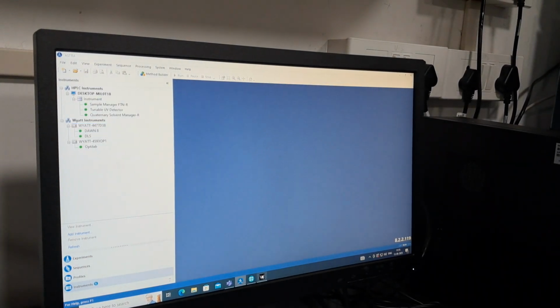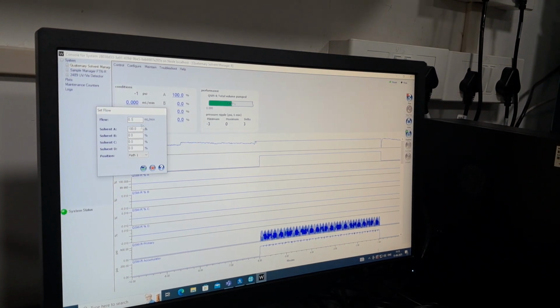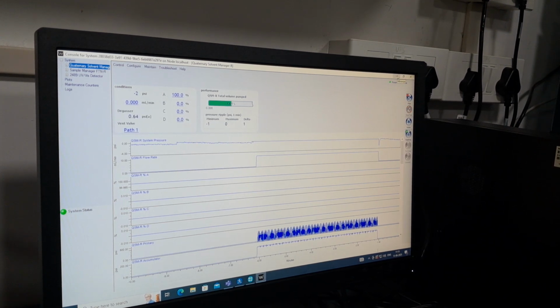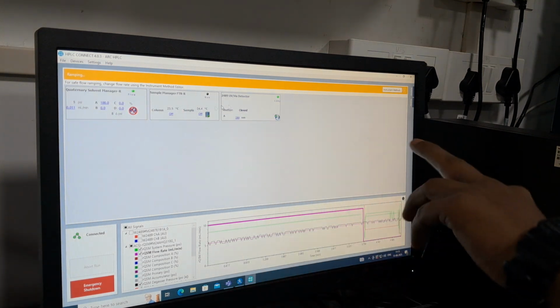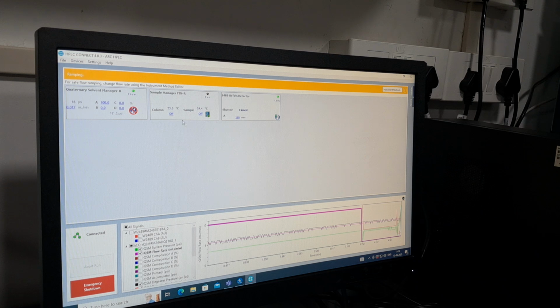Now the flow rate we are able to set here. Ideally we are using 0.5 flow rate. Now I'll be increasing it step by step. This console, if you want, you can familiarize yourself with it. If it is easy to use, then you can use it, or else you can run all the parameters through the HPLC Connect software. The console comes from a right click on launch console, so that gives detail of what is going on in the system.